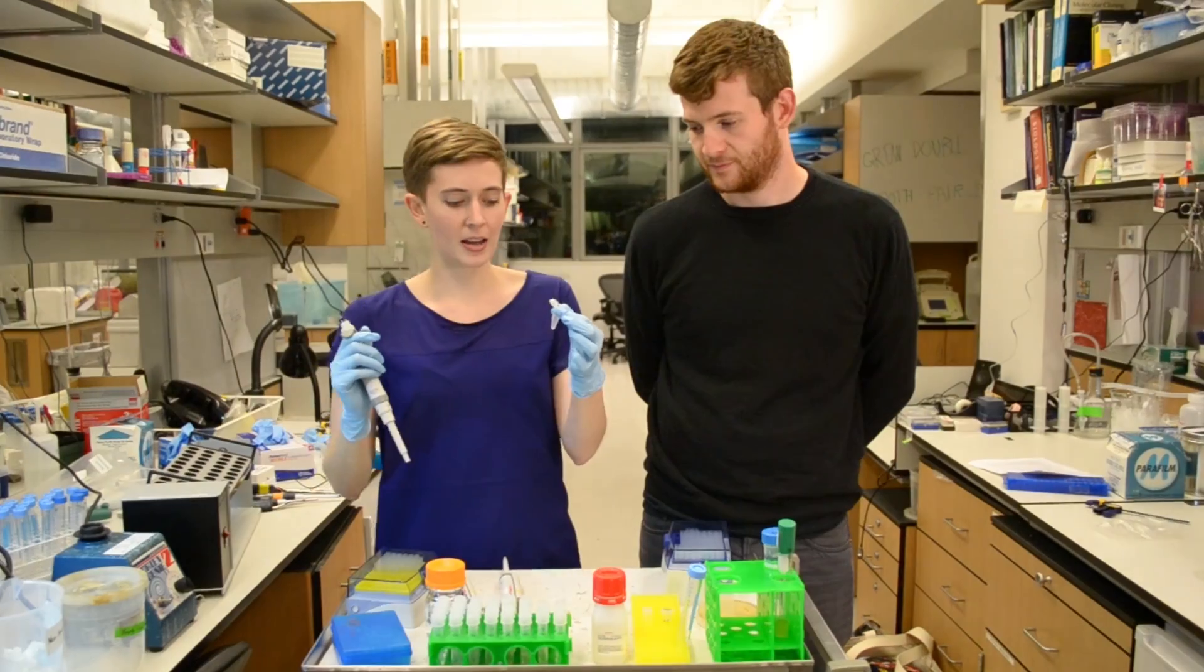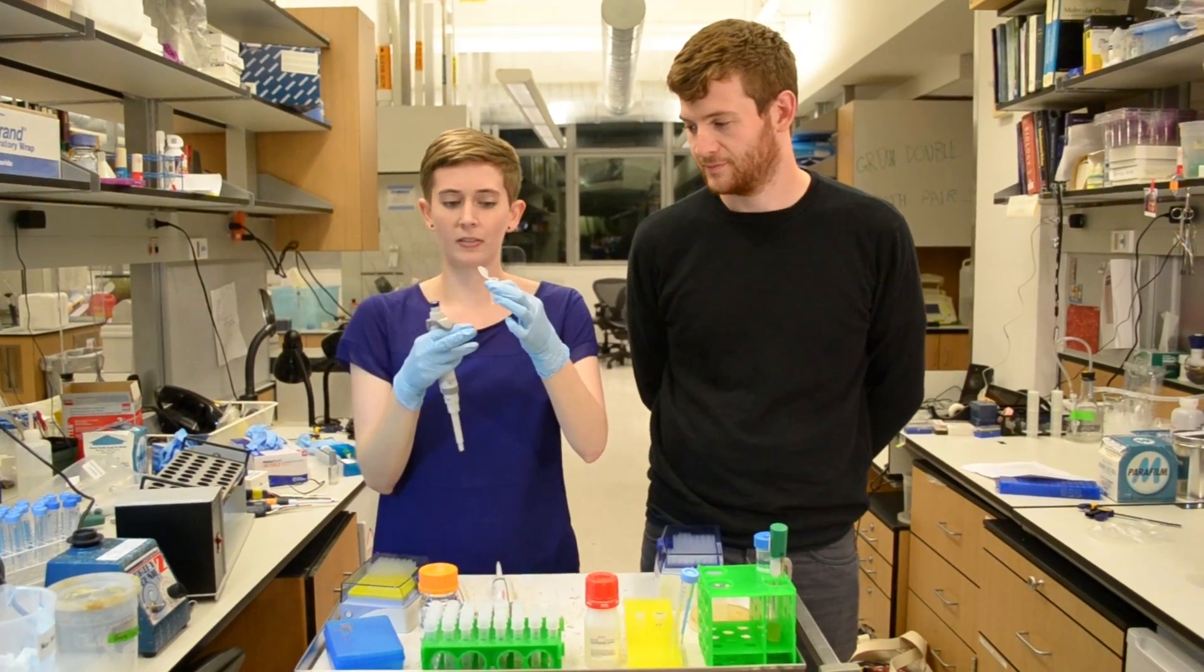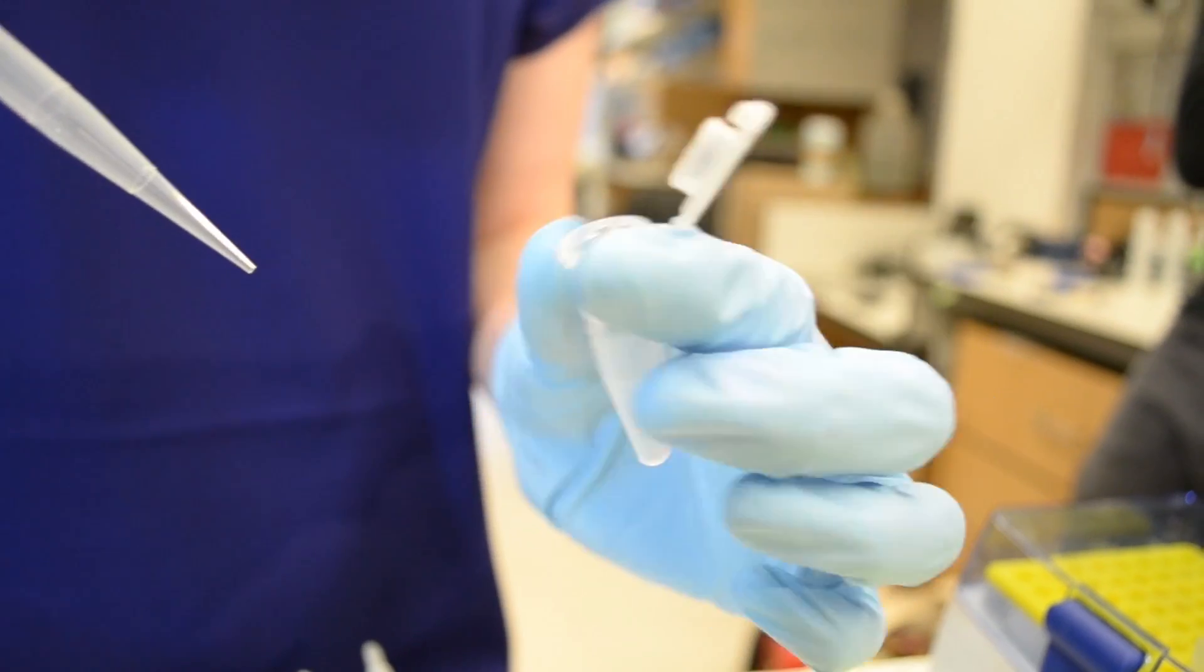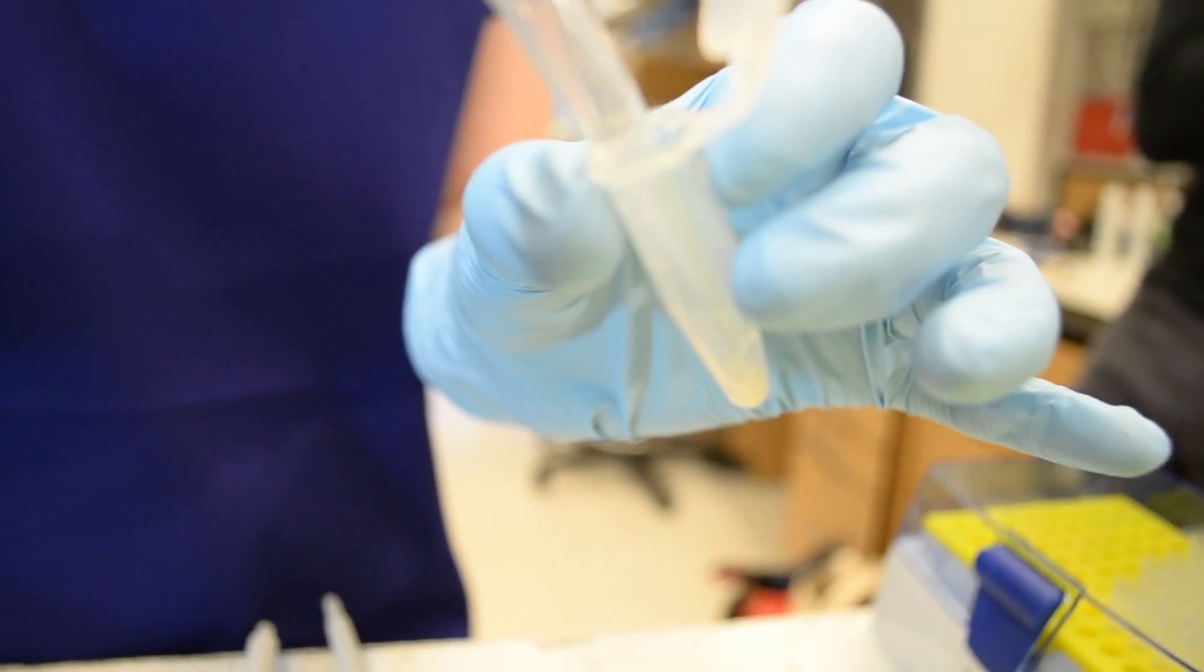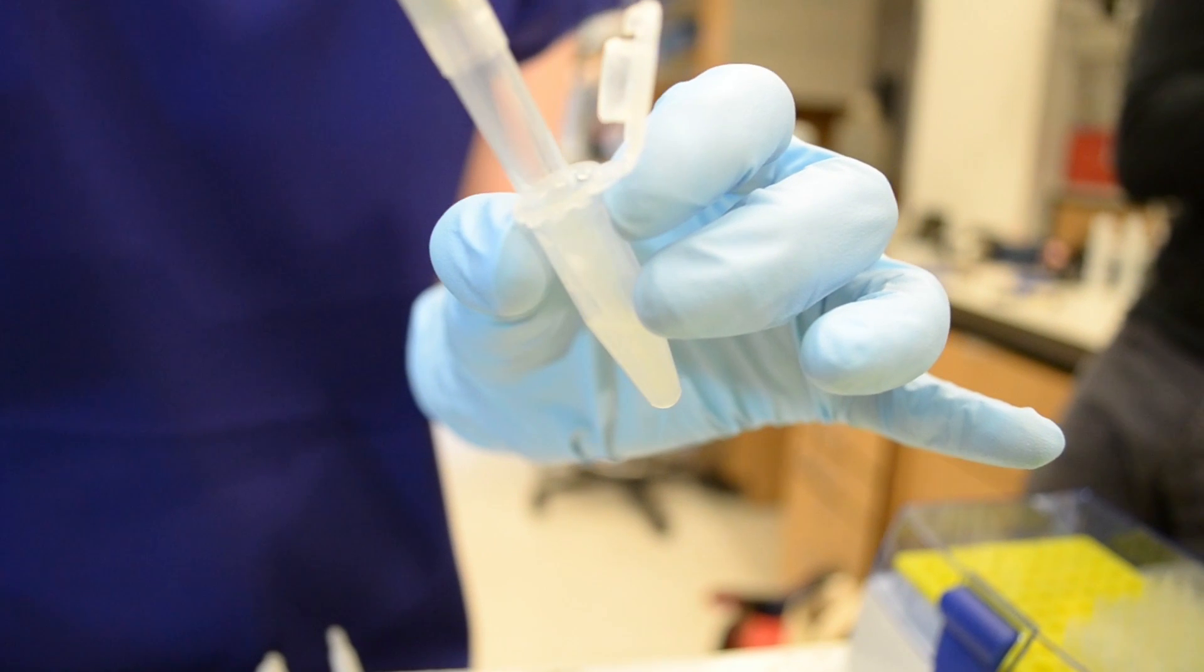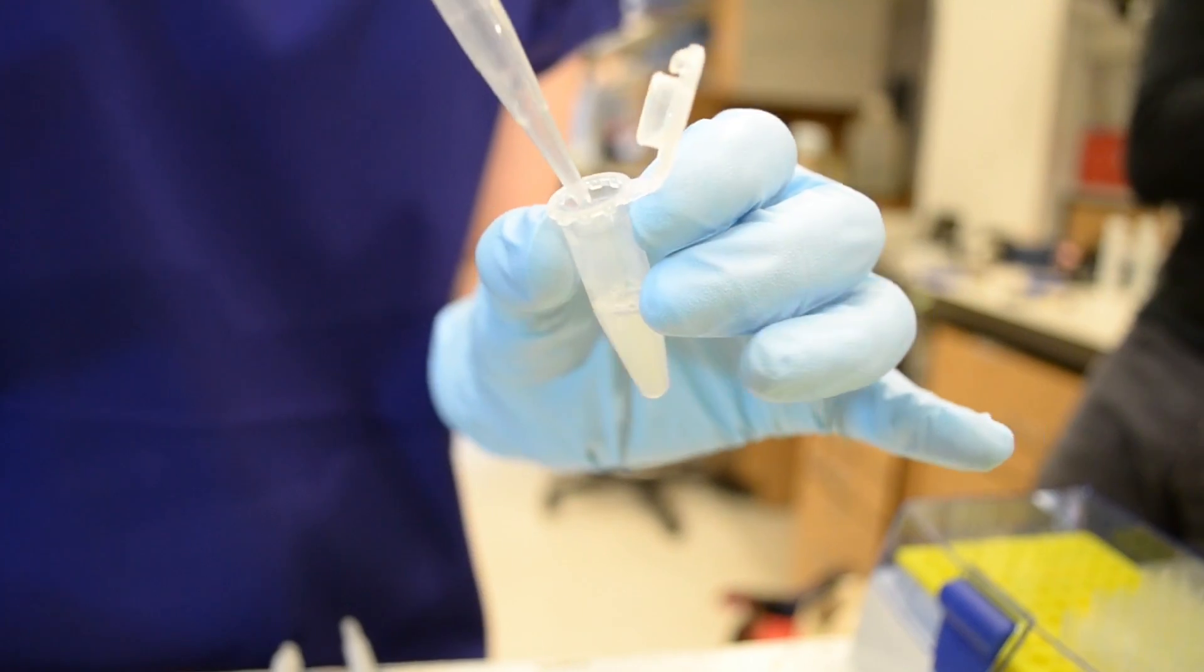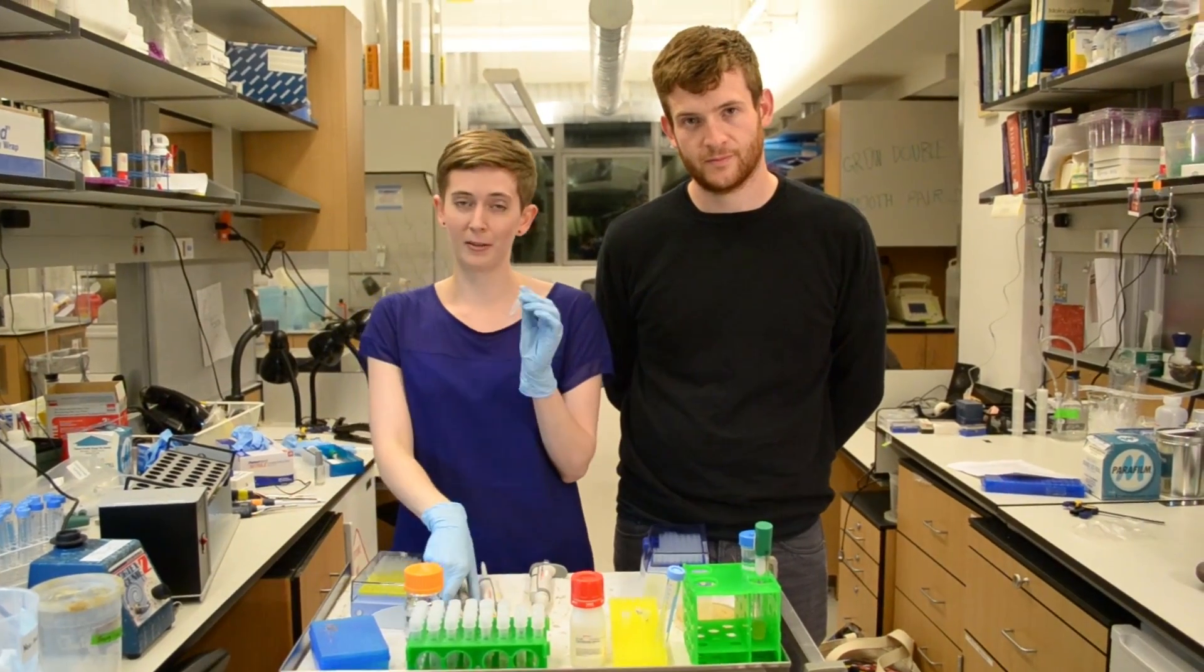Now it's time to digest the cell walls of the yeast, so I'm going to add a mixture of enzymes to that pellet of yeast cells. This gets rid of the cell walls because we want to see what's inside the cell. Then I put them on the rotator for a while to make sure that the digestion is complete.